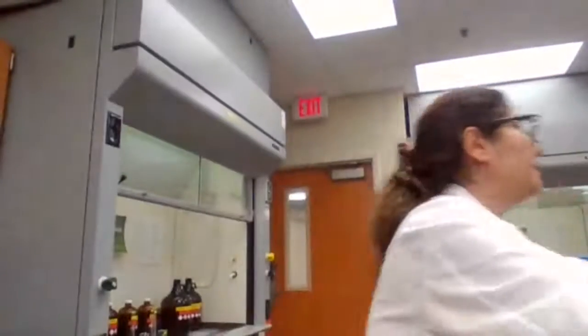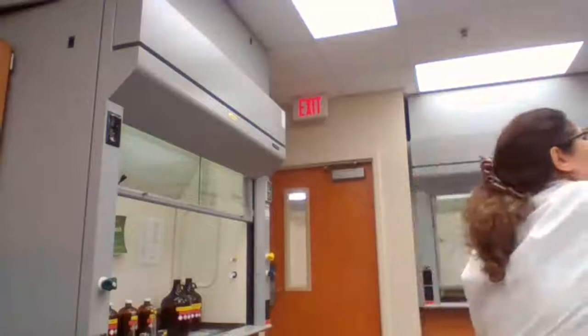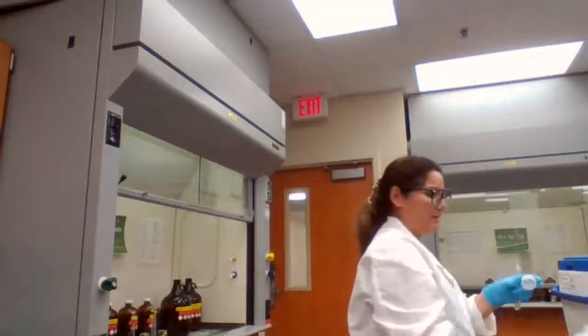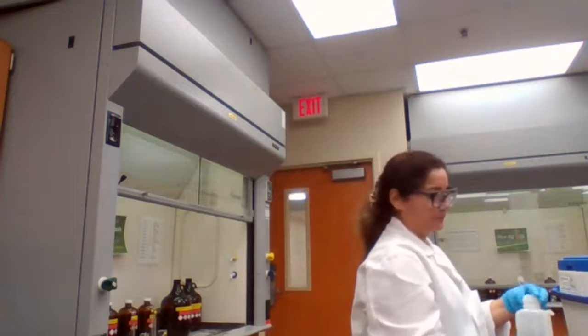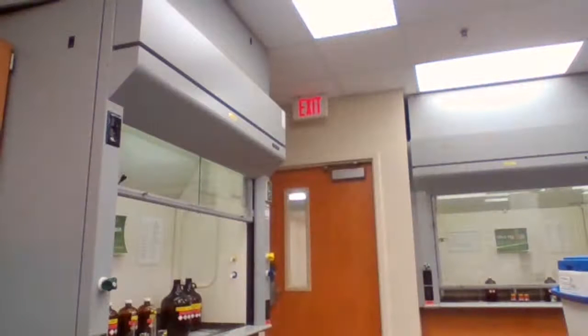So we need hot water baths. I'm going to prepare the hot water bath. You discard the water already.